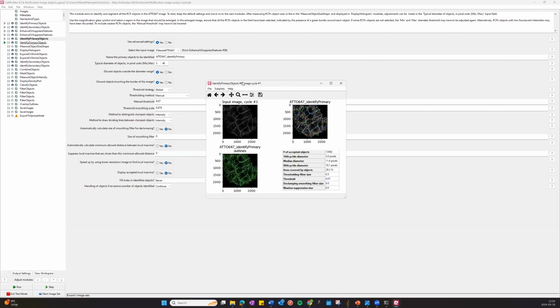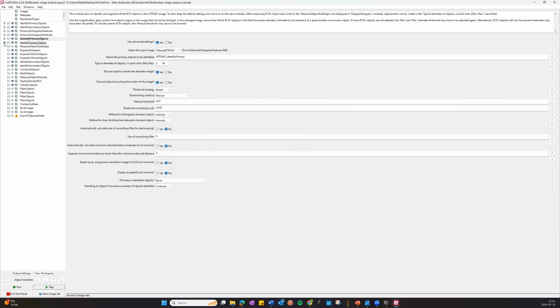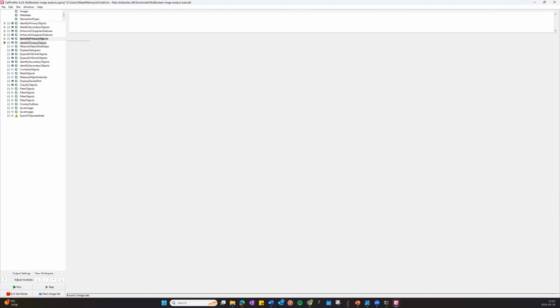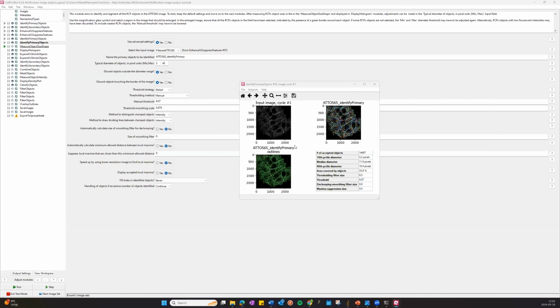That's the first one. I will walk you through these results very soon. I'll click the second one also, identify primary objects for the 565 channel. Click step on that. The results for the 565 channel. Again, I will mention this later.